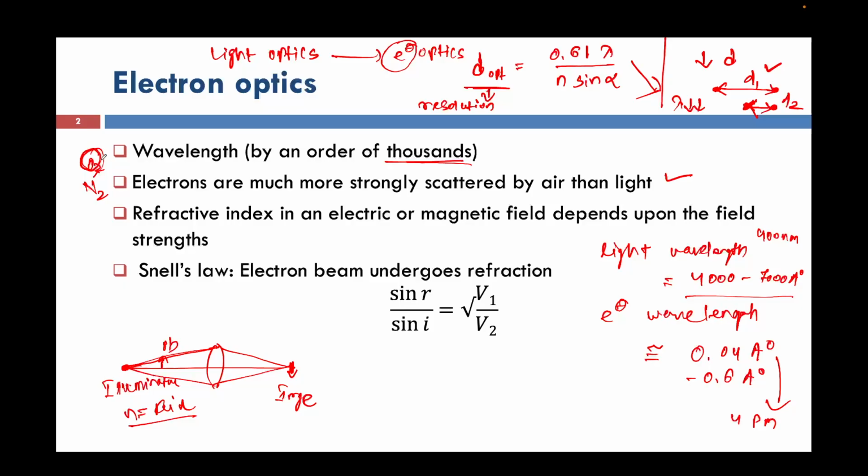So this is one of the reasons why we need vacuum. That is why in electron microscopy, be it scanning electron microscopy or transmission electron microscopy, the process of image collection is different, but the fundamental mechanism behind them is the same, because in both cases we are allowing an electron beam to fall on our sample and then give us crystallographic information or microstructural features, right?